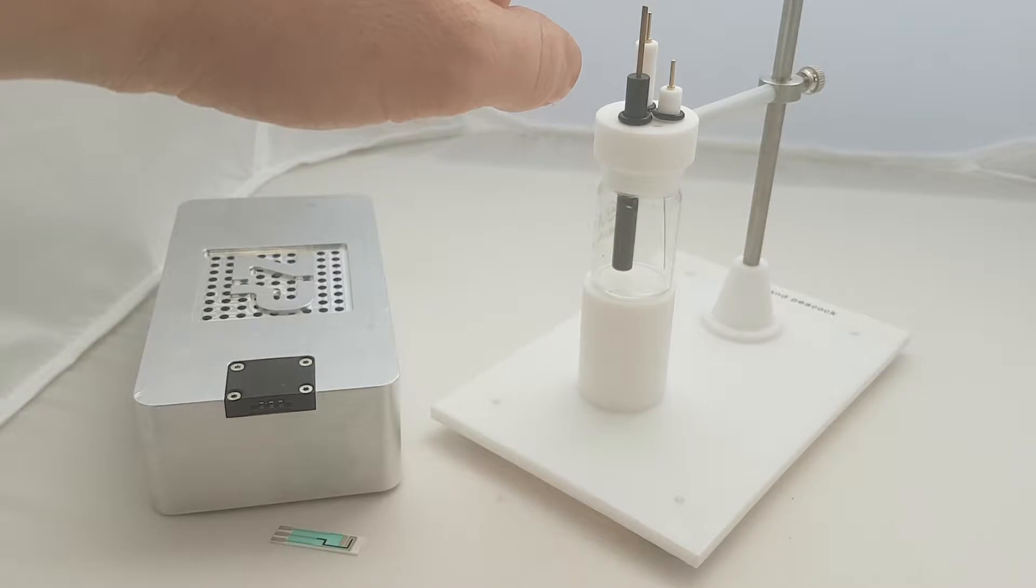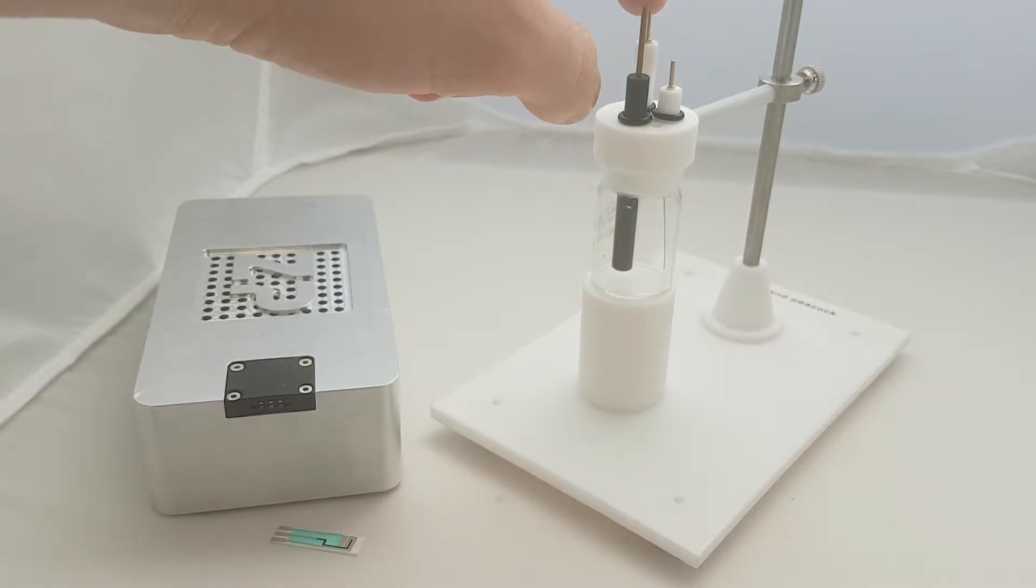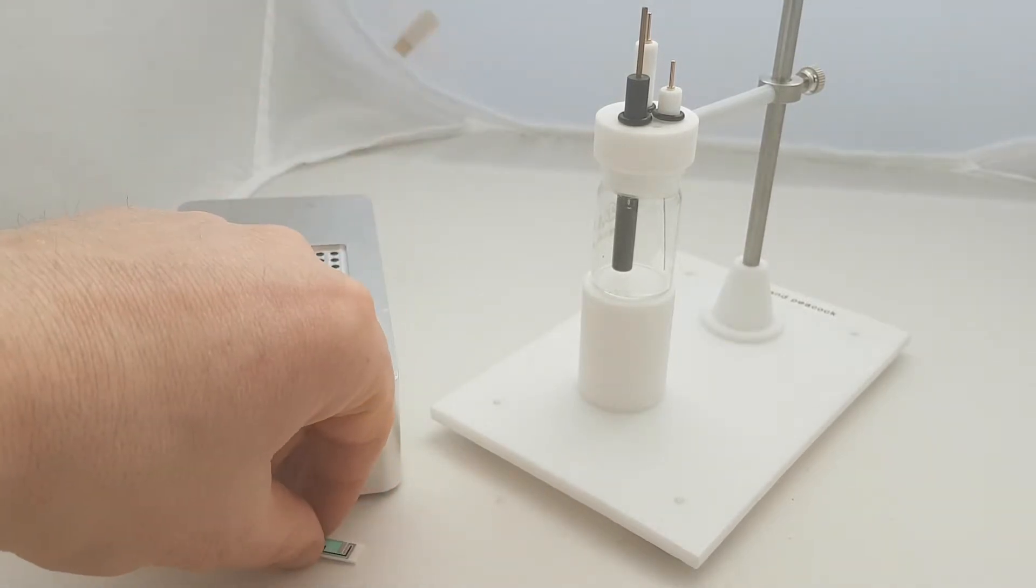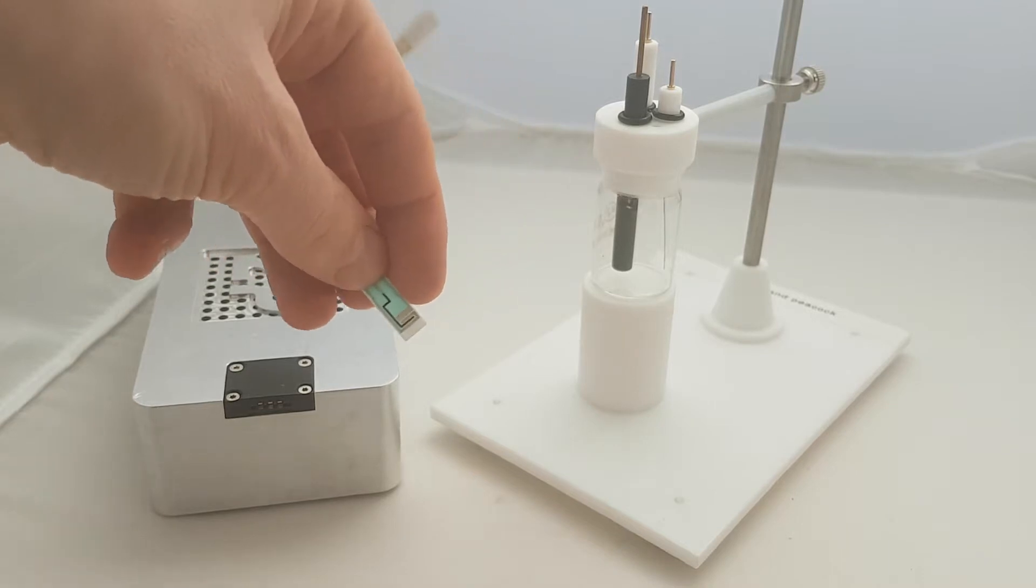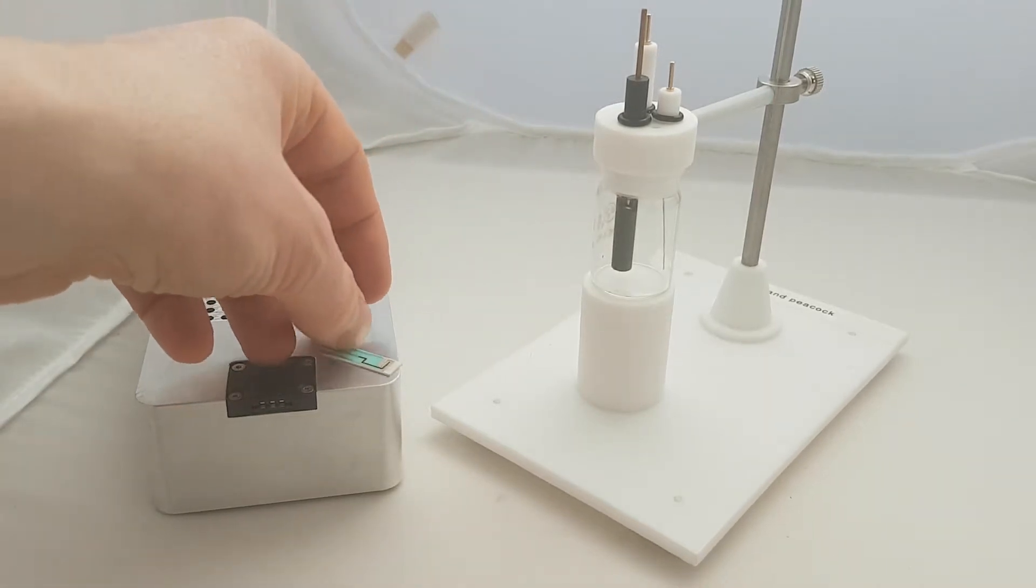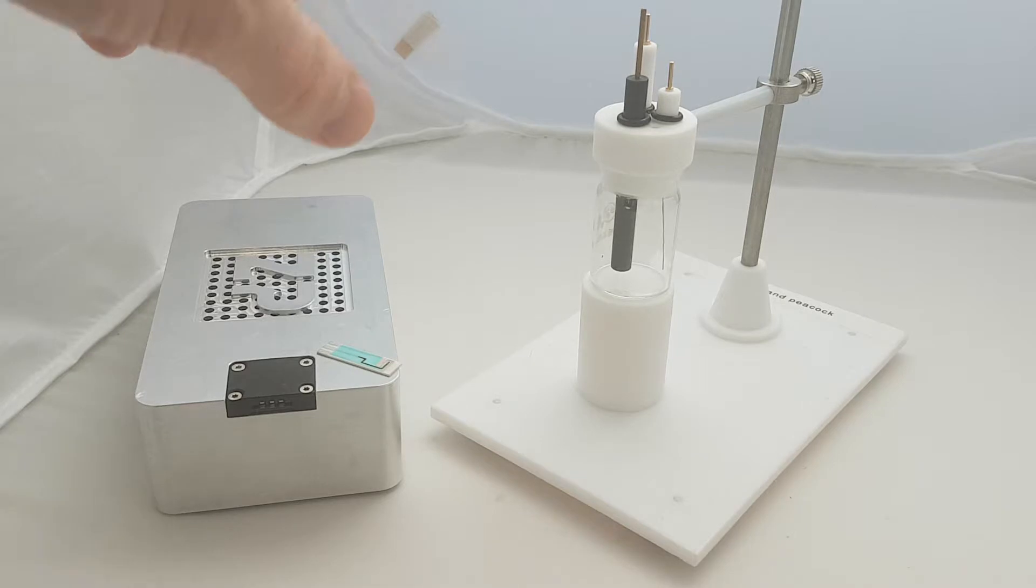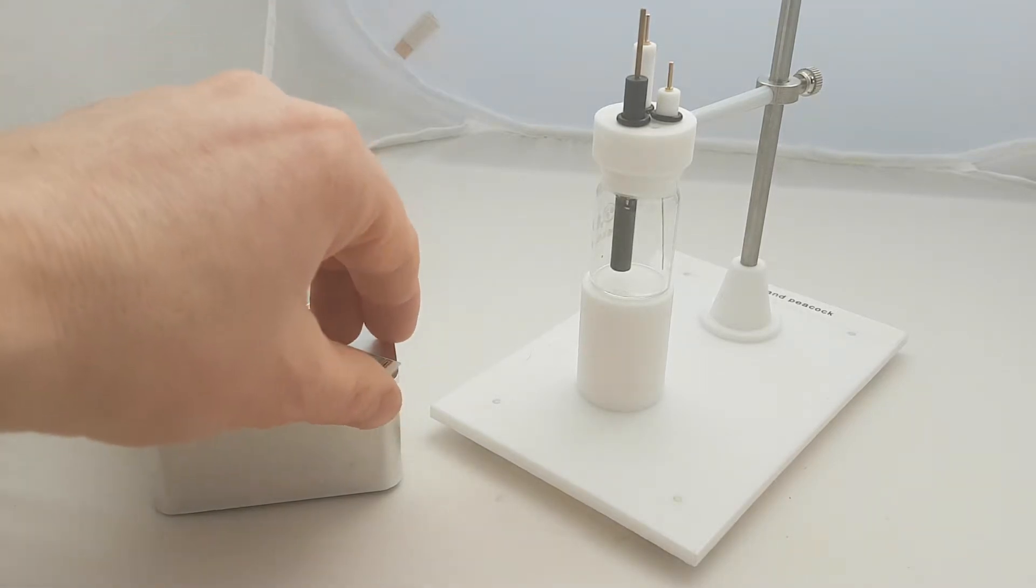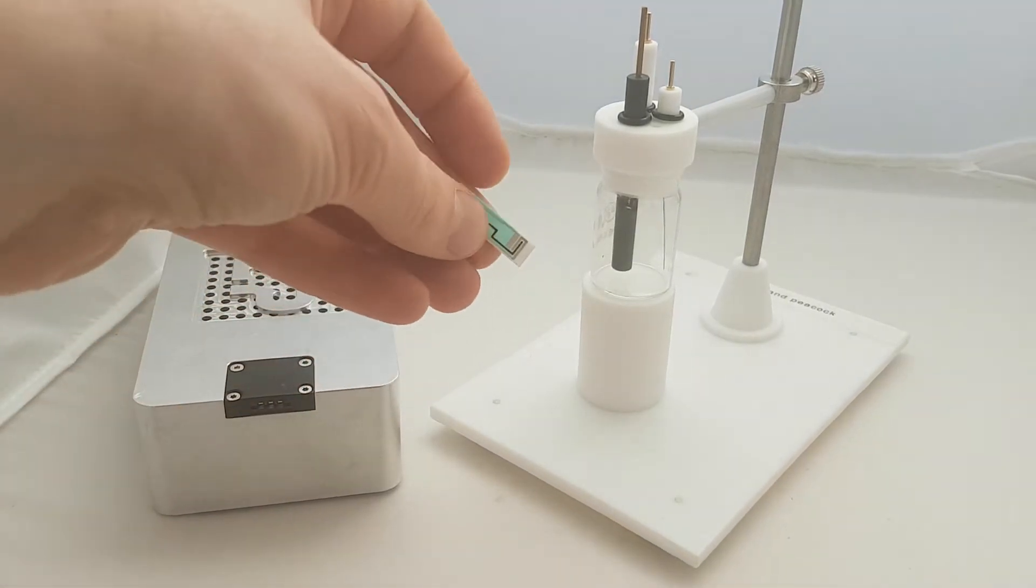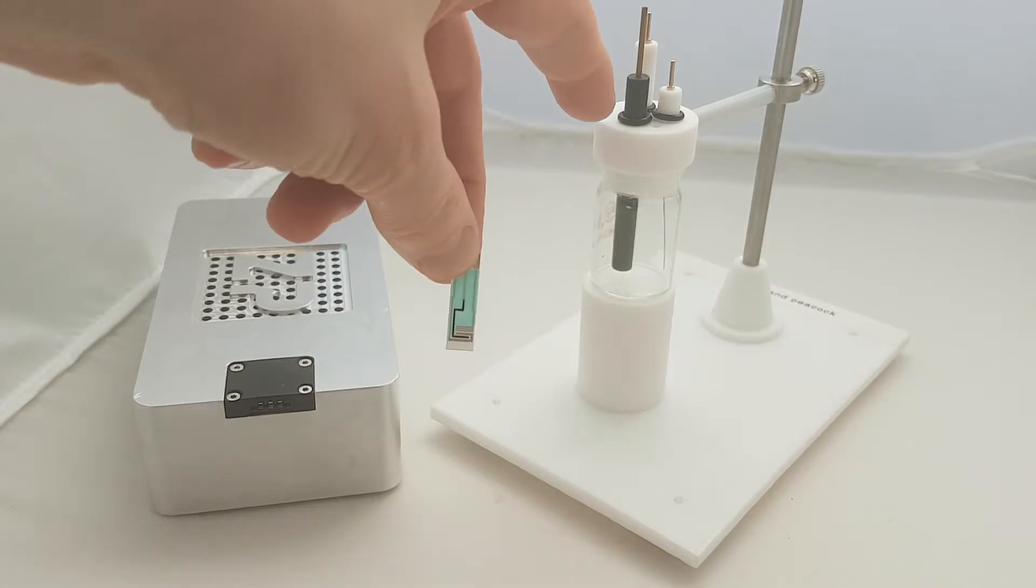In this particular case we have a carbon working electrode but it could be platinum or gold. We have a reference electrode that's silver silver chloride, that's a good one for us because we often use silver silver chloride on the biosensors or sensors themselves, and then we have a platinum counter electrode. These look very different in terms of this looks very different from the cell.